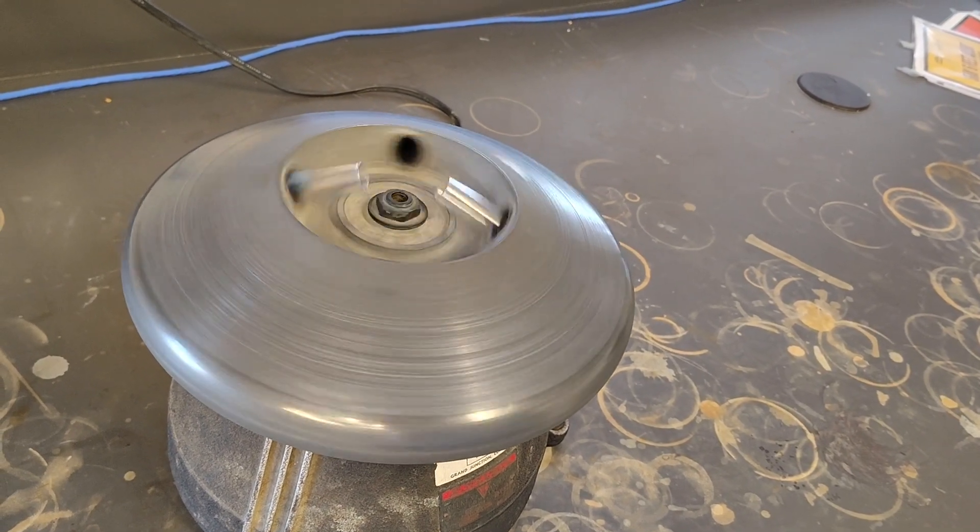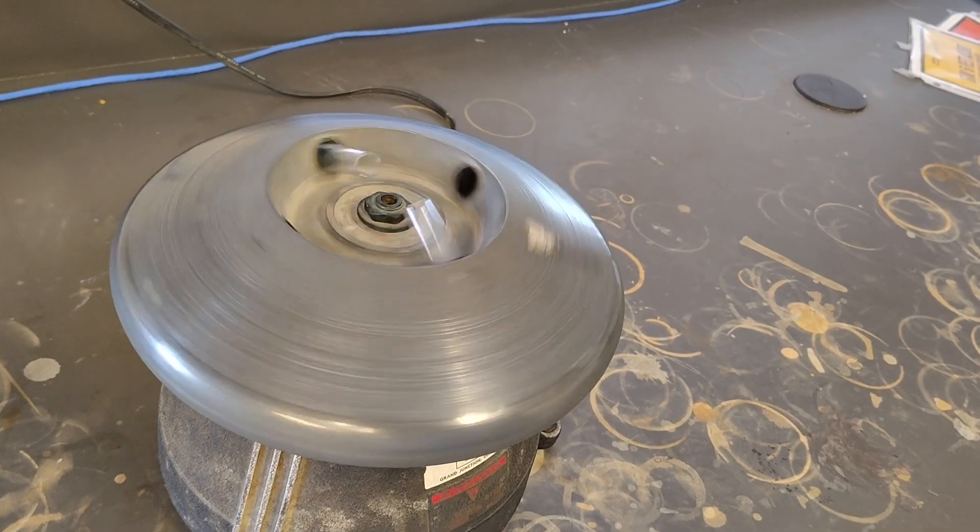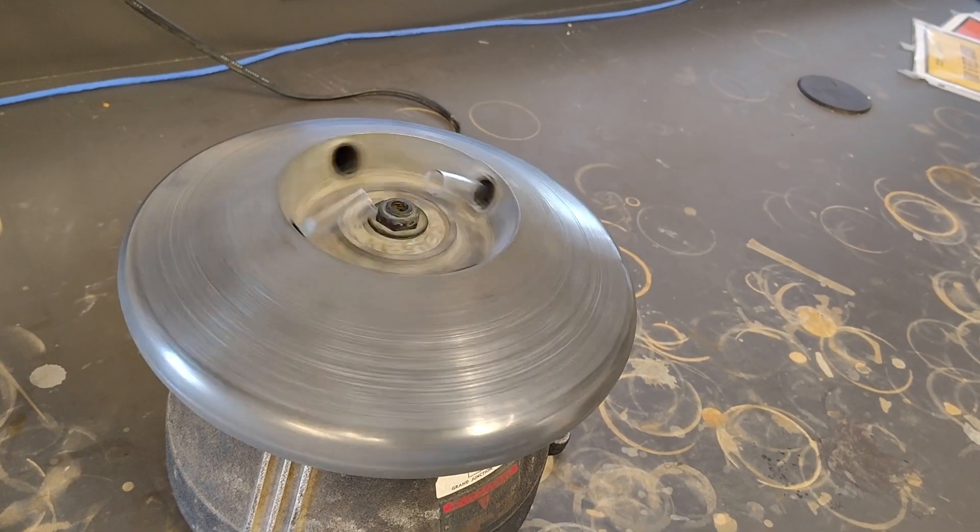It takes a little while to slow down because there's not a lot of friction on there, which is good. You don't want a ton of friction on your centrifuge.